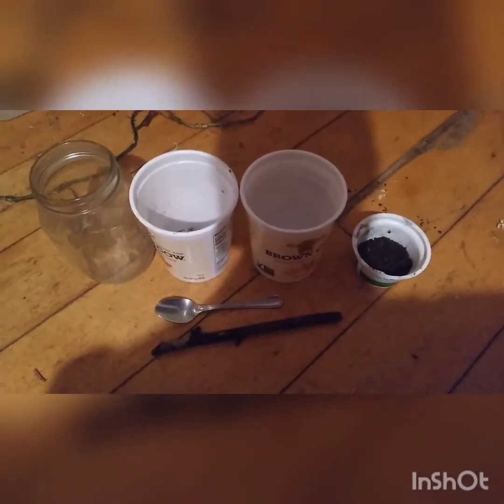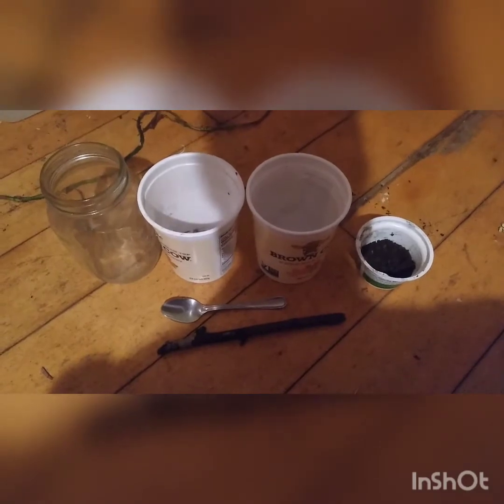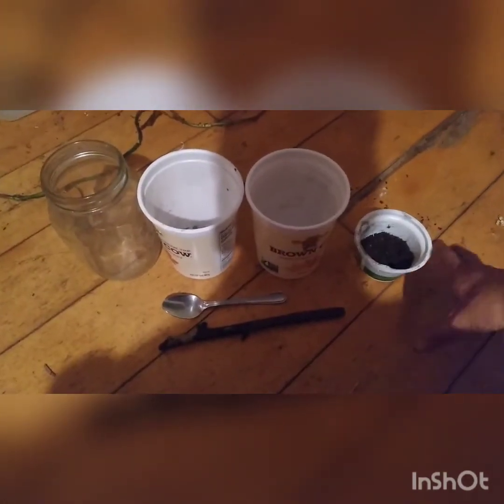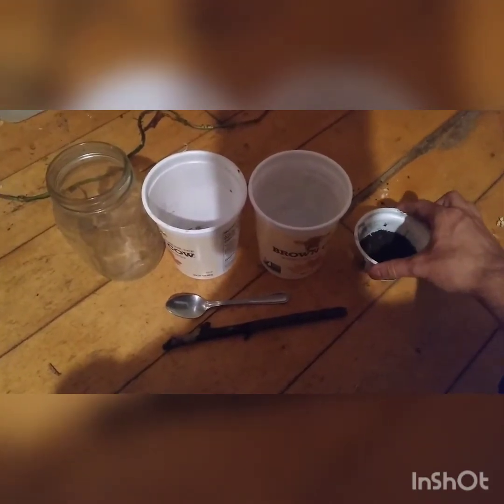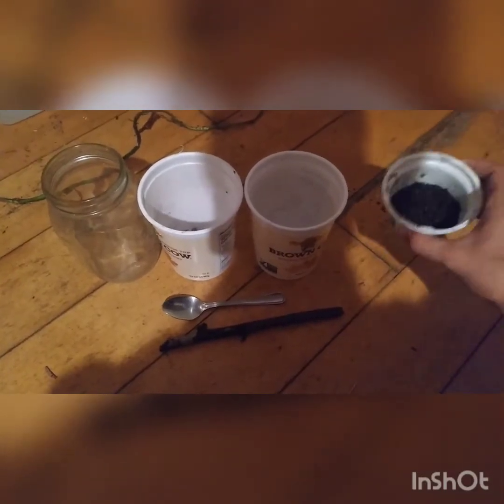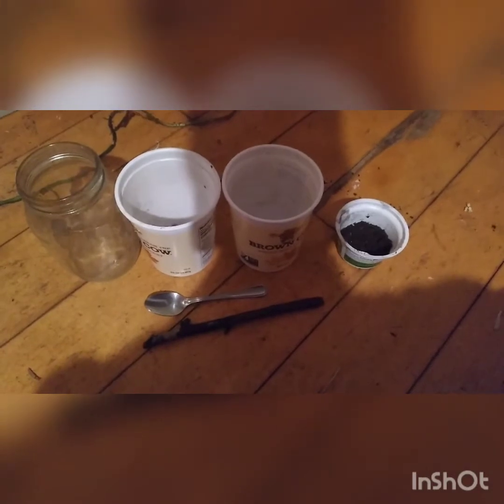Hello, this is Tobin Gordeski-Hooper, and I'm one of the Wildwoods interns. I'm going to show you how to separate out fungal spores from forest soil to make a more concentrated mycorrhizal inoculant.